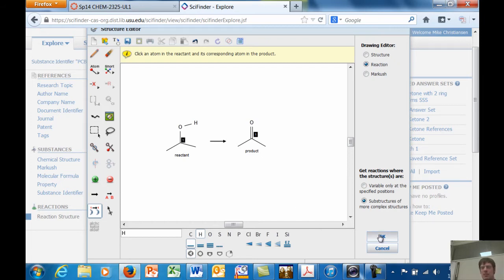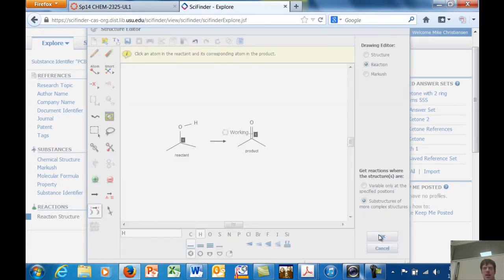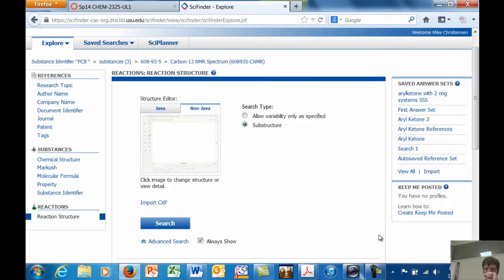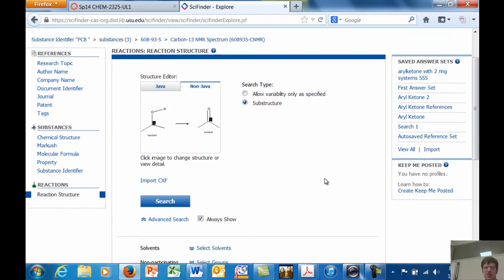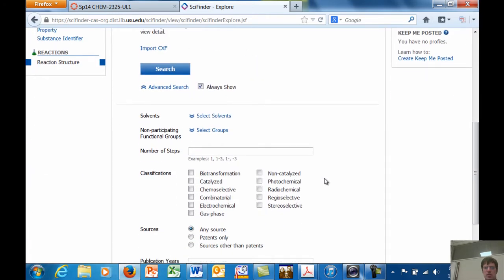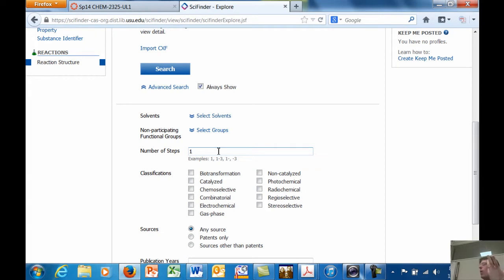Now I do that, I hit okay, and you can do a bunch of other search options here. For example, if you want to limit the number of steps, you could say I only want one reaction step. Or you could say one or two.